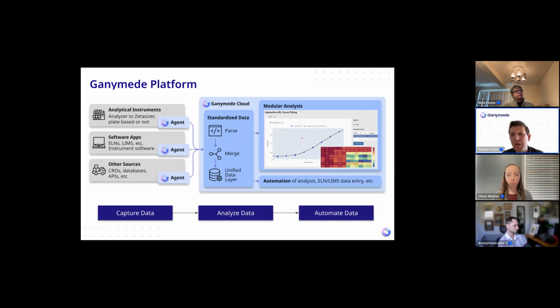And so we found that in cases like chromatography, for instance, we've been able to partially or fully automate peak finding to recommend peaks to our end users rather than them having to repetitively fill them out every time. Or even change it to a review by exception workflow where the peaks are just there and they are saying yes, or there's exceptions and they say, oh, this looks like something I want to investigate more. It's really transformative in terms of being able to actually leverage that automation.